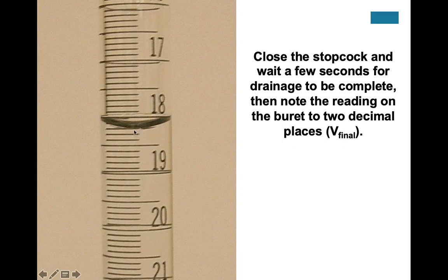And then we make the measurements. So why don't you go ahead and practice, take a moment. All right, and let's check out what the answer was. So 18.20 milliliters, 18.21 milliliters, any of those would have been fine. And then you subtract those two numbers, the final volume minus the initial volume, and then that would get you the volume of base that we dispensed, the titrant.